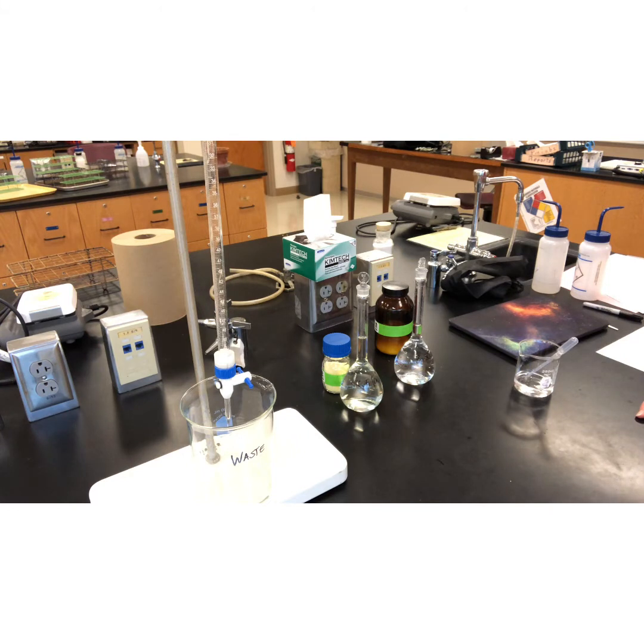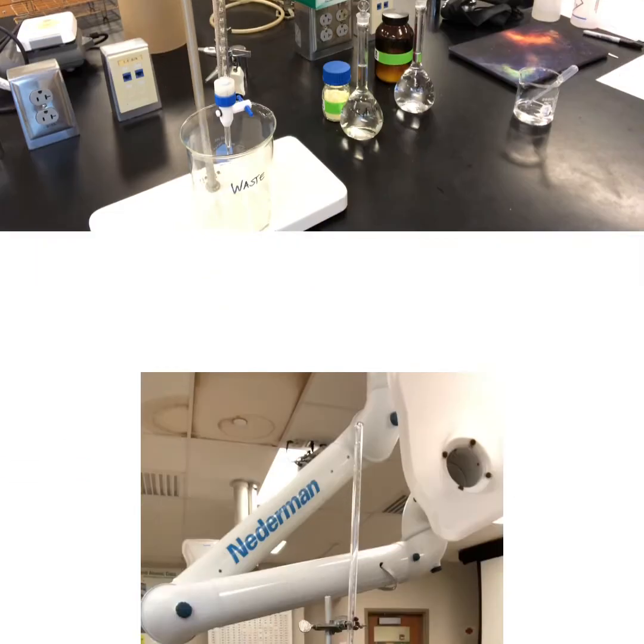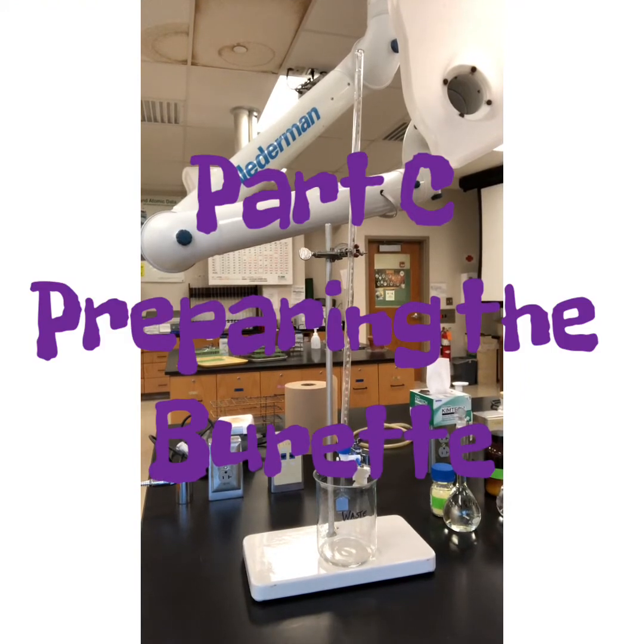We're going to prepare our burette for titration. I'm going to actually move the camera just a little bit so you can see the full burette, because you can't really see it. So, be right back. All right, my friends, here we go. I've reoriented the camera. Now you can see a full picture of the burette.